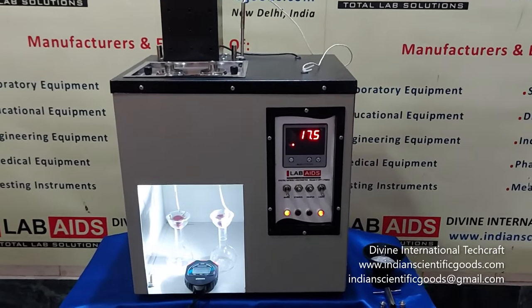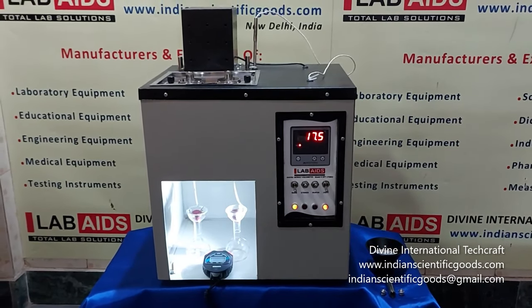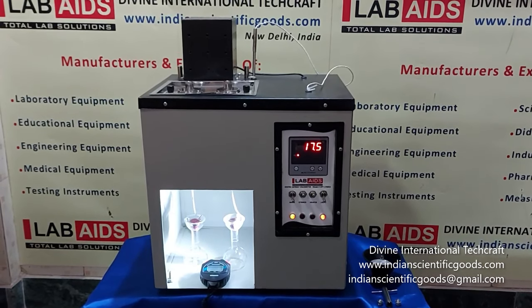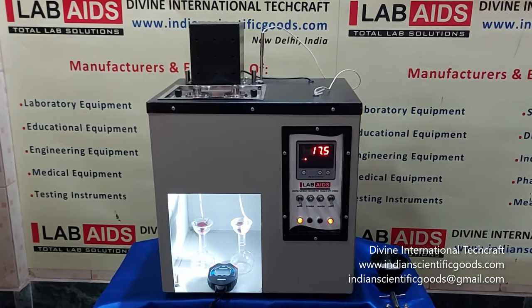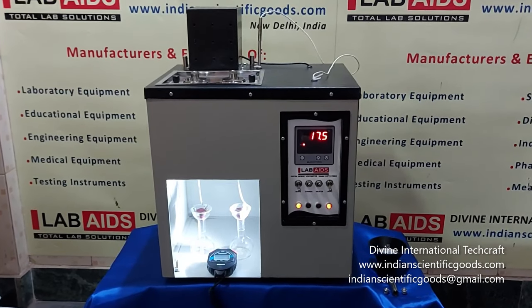A Saybolt viscometer is used to determine empirical measurement of Saybolt viscosity of petroleum products at specified temperatures. The time it takes for a 60 ml sample to flow through a tube with a hole of specified diameter — furol and universal — is measured and reported in seconds.